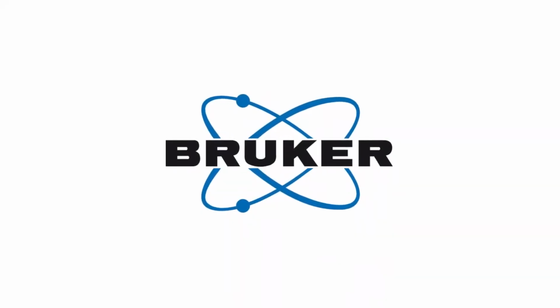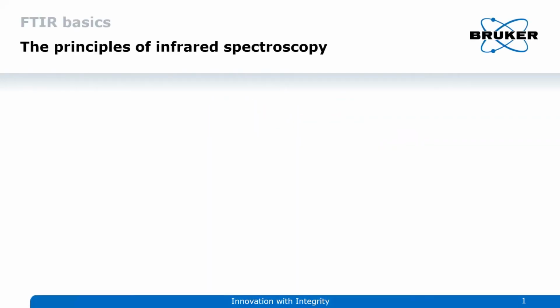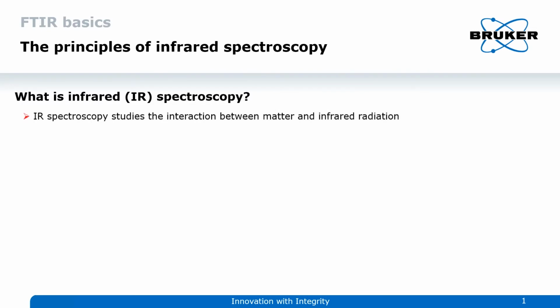Welcome to the Principles of Infrared Spectroscopy. Let's get started right away with probably the most important question. What is infrared spectroscopy? Basically, infrared spectroscopy studies the interaction between infrared radiation and matter. We might end this presentation right here, but you may ask, what is infrared radiation?